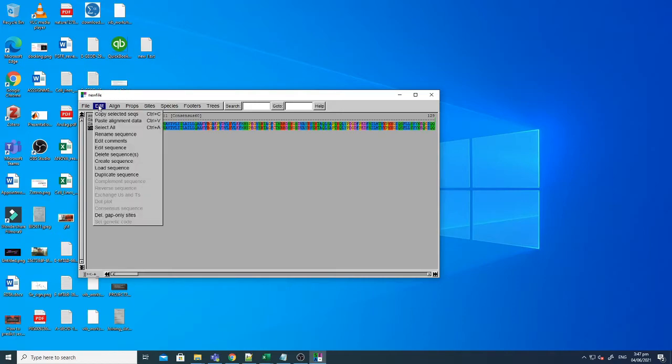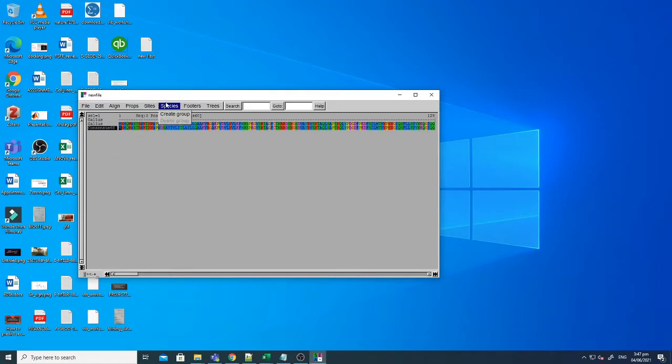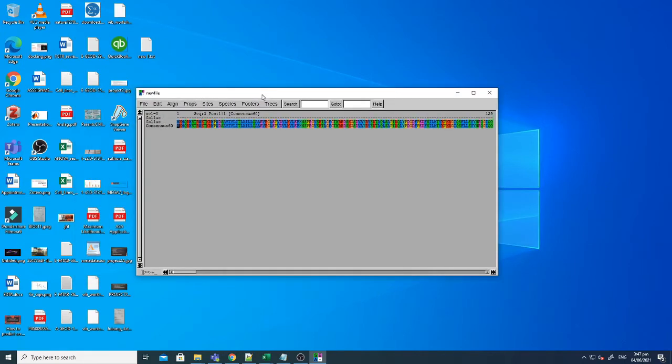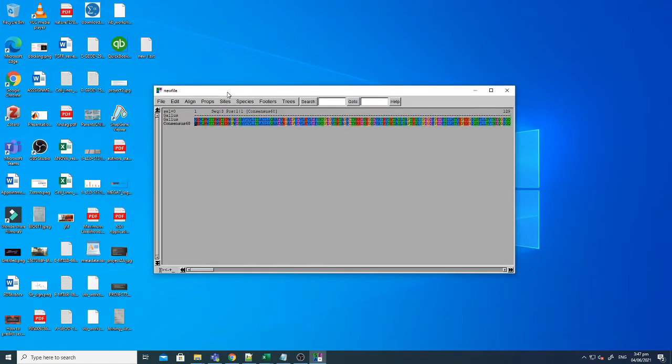So here I just taught you how to build a consensus sequence using different sequences of your interest. I hope this is very easy and straightforward and I hope this will help you in generating your own consensus sequences of the sequences you have in your hand. Thank you very much, bye bye.